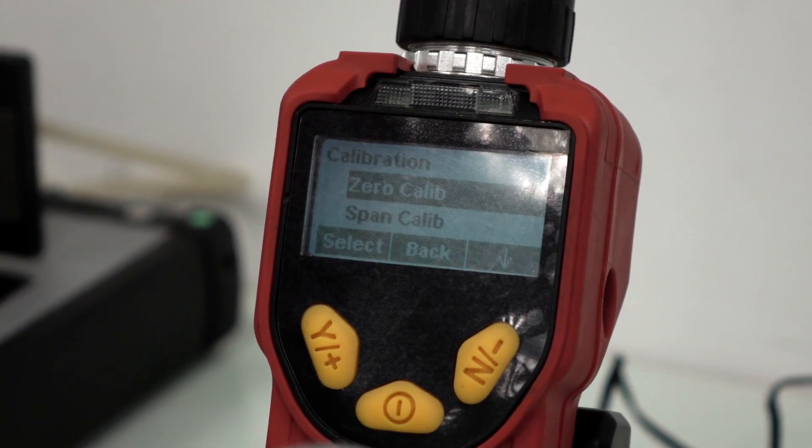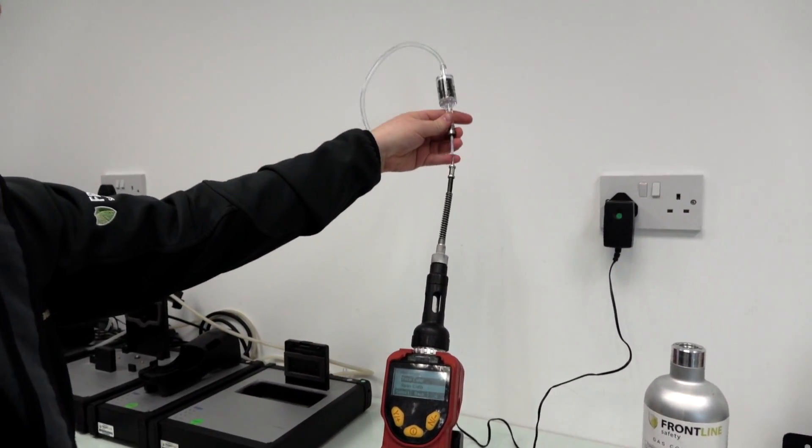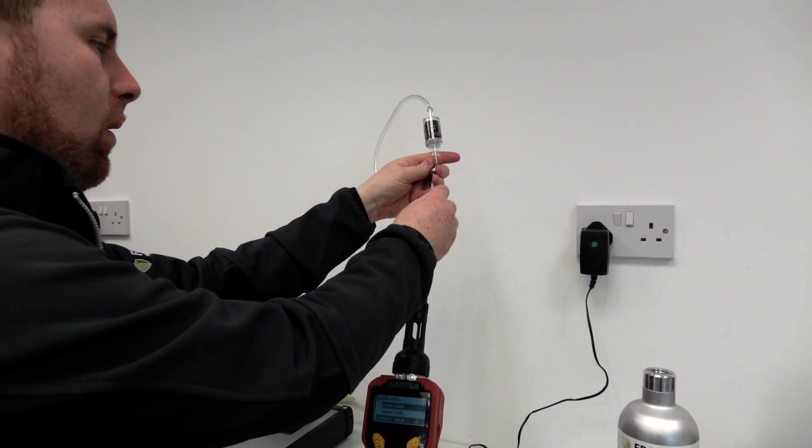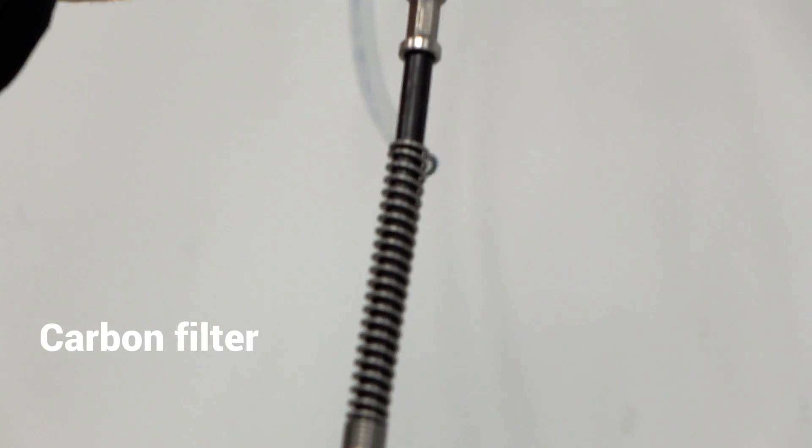The unit will now count down from 30 to zero. If you're not in a fresh air environment or you need to perform the calibration in the field, use a carbon filter by attaching it to the probe as shown.